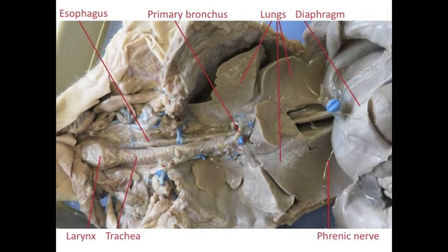The esophagus is shown here for reference; it passes food from the oral cavity down towards the stomach. We're more interested here in the airways, so that starts superior with the larynx. The larynx is a large structure that we term the voice box, and it leads into the trachea. The trachea clearly has cartilaginous rings that make it easy to identify.